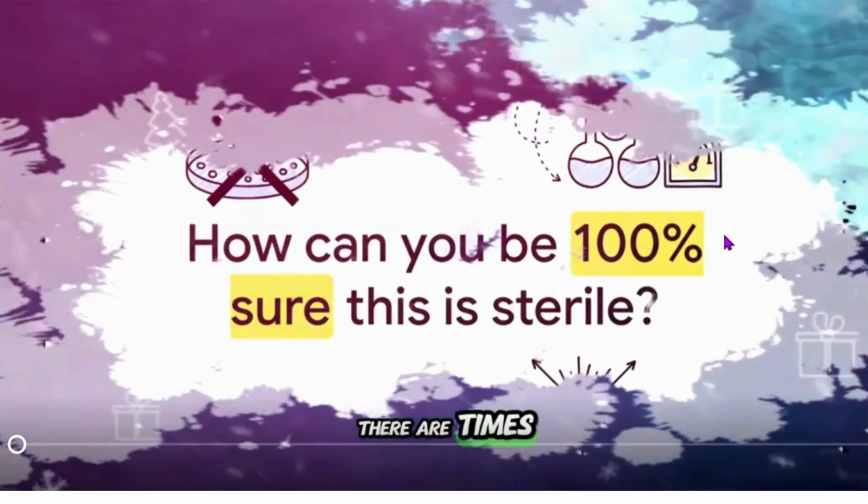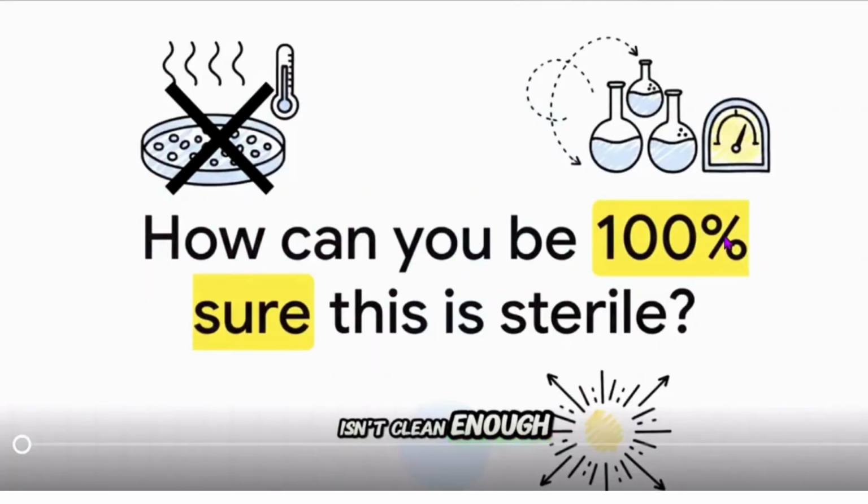I mean, really think about that for a second. When someone's life is on the line, how do you actually prove that something is completely, totally, and quantifiably free of any living microorganisms? You can't just eyeball it, right? This exact question is the whole reason the F0 value was created in the first place.